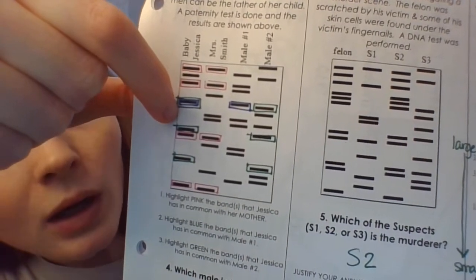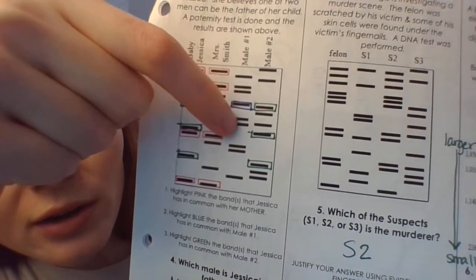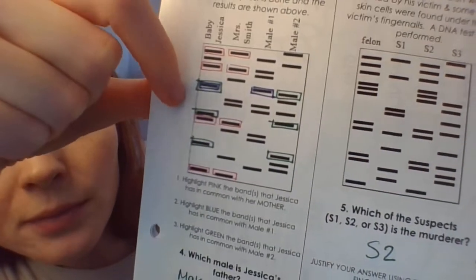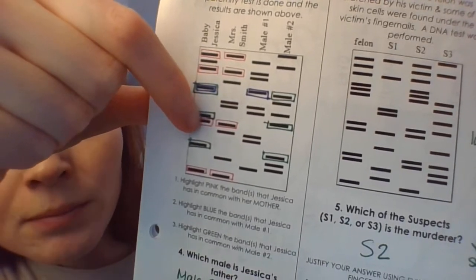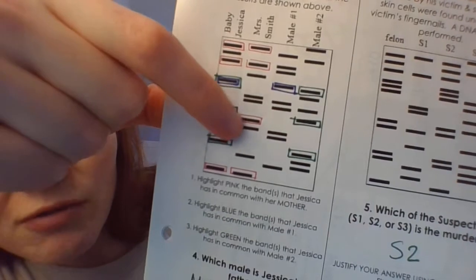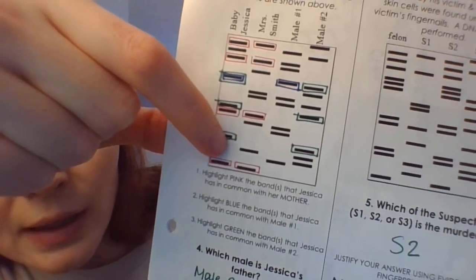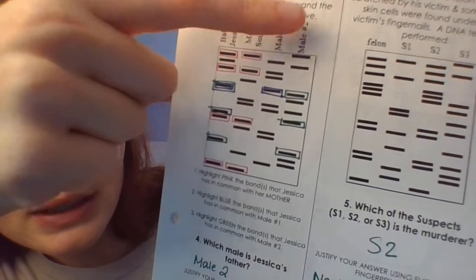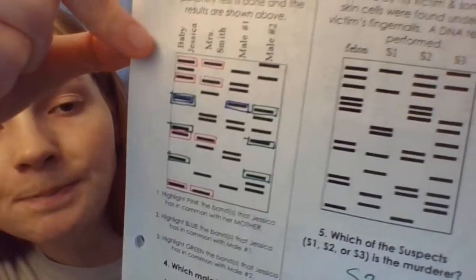Fourth band, well, she could have gotten it from 1 or 2. So that could be both. This band, just from 2. This band she got from mom. This band, only 2 has it, and this band from mom. So from this, we can tell that male 2 is the father of the child. Okay?